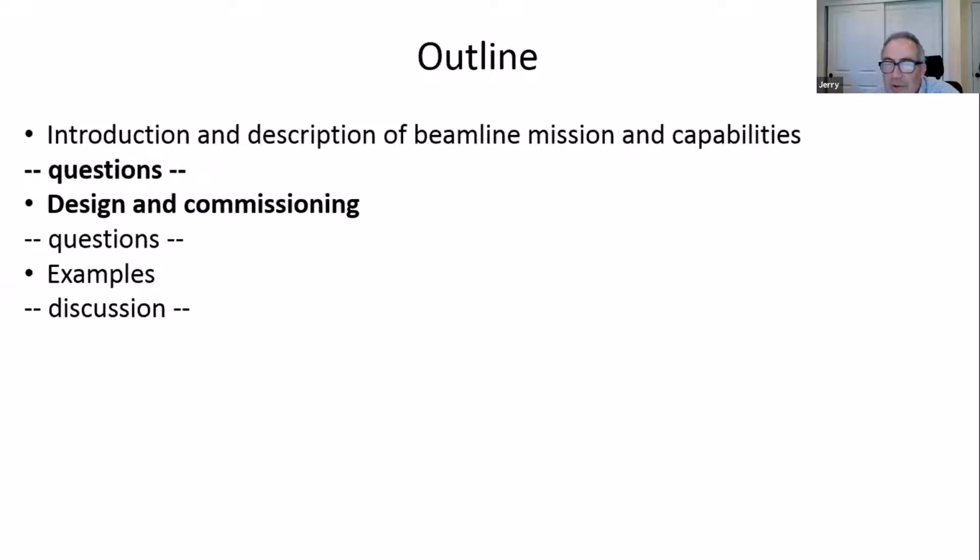Kagesh, is your microphone working? Yes. Please ask your question. Please do. Yeah, I have two questions. So first is, as the wavelength changes, the focal length will also change. So how is that taken care of while recording XAS? The microfocusing is done by KBs, which are achromatic. So the focal length does not change with energy.